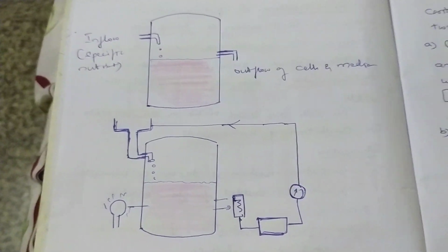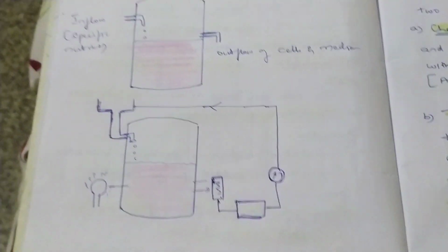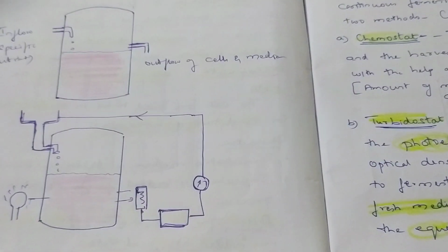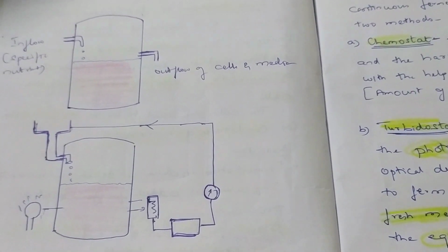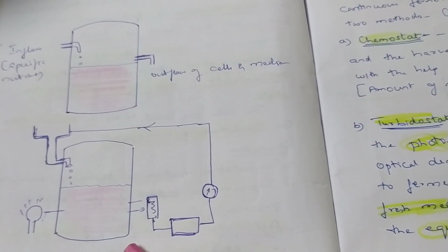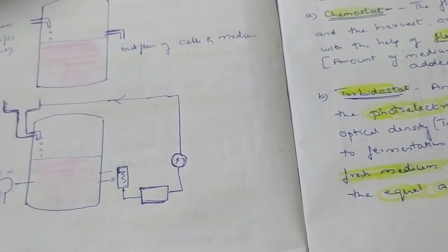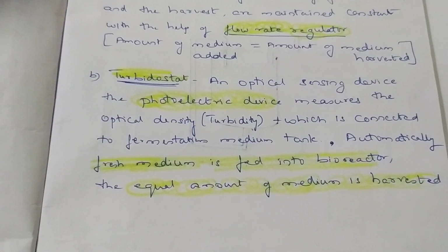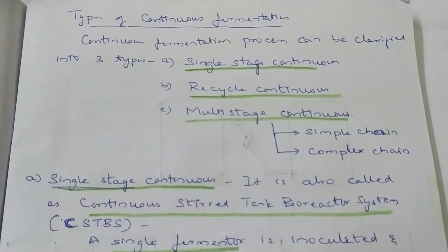Turbidostat is also one of the important technologies which are very useful in industry. Don't think that you're using this only for studying growth curves. You must try to implement whatever you study in the growth chapter for bacteria or any organism by these techniques. Of course, we all know that turbidostats are more suitable for bacterial cultivation, not very much for fungal cultivation, because density is very high in fungi. So that's one of the pieces of information we can gain. There are different types of continuous fermentations.